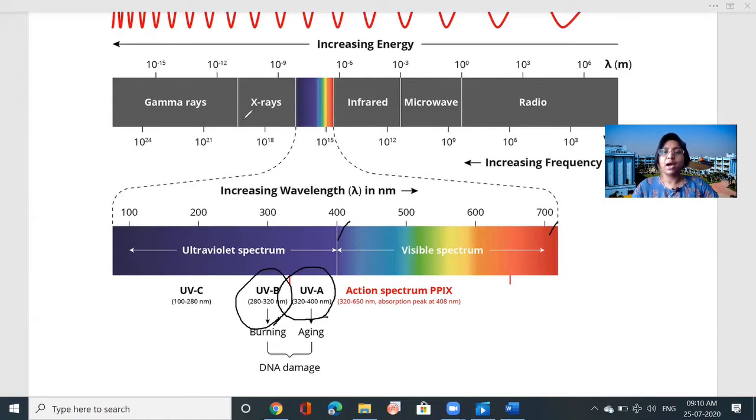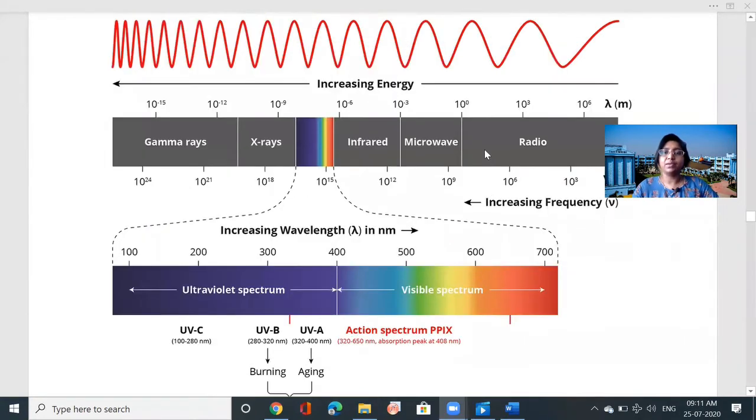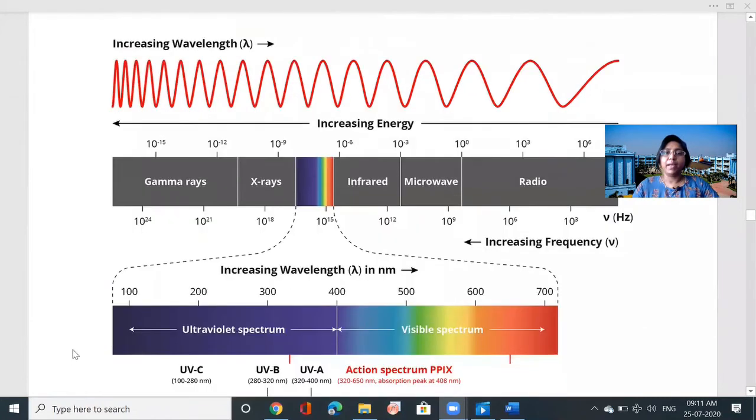So you have understood the different types of electromagnetic radiation. X-rays, for example, are used for chest X-ray. We can see the internal organs, whether there is any fracture in our leg or not. So every electromagnetic radiation has a specific energy level, specific frequency, and specific wavelength.